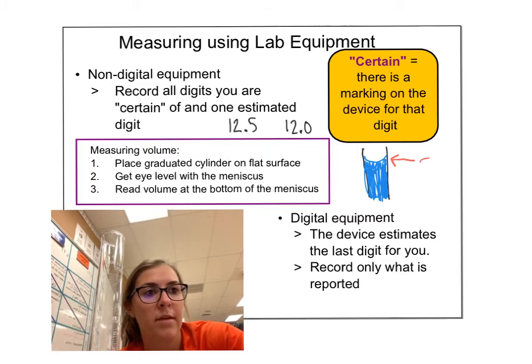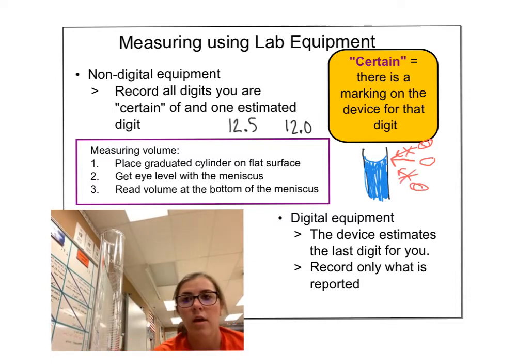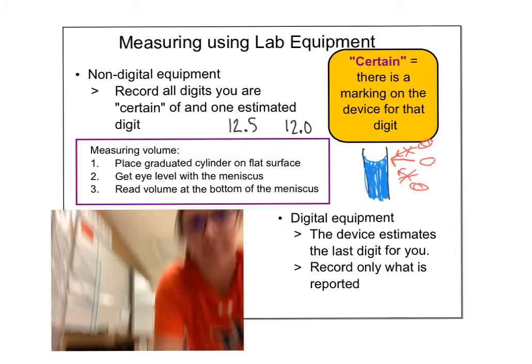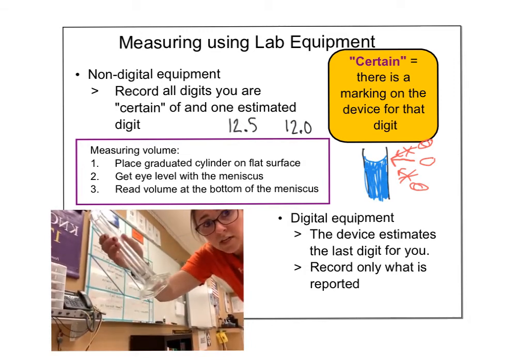Right there. So I need my eyeball right there. I don't want to be looking from up here or from down below. That's a bad angle, we say in softball. Bad angle. Okay, so let's look. I'm going to pretend the water line is to here. I'm not going to hold it up in the air. That makes it tilted. What a waste of time.